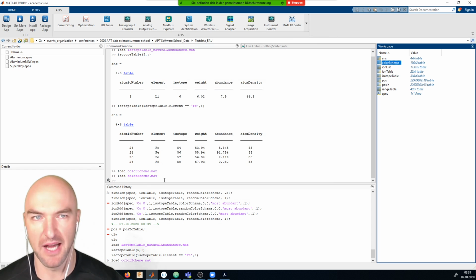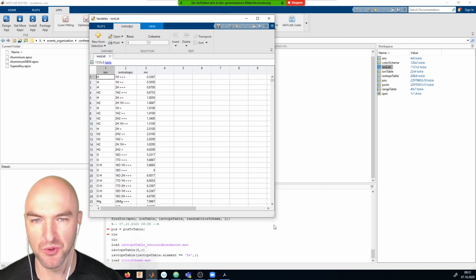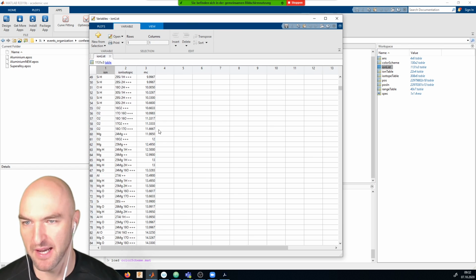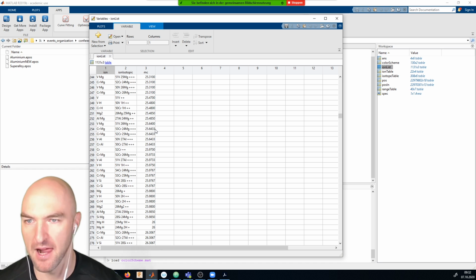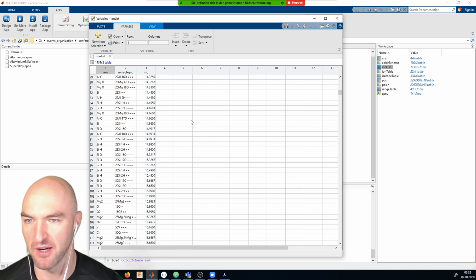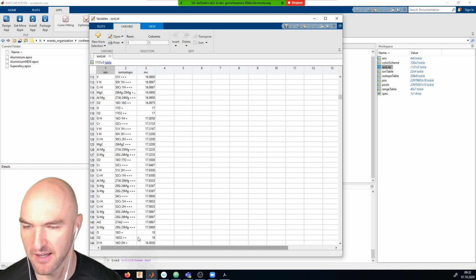Okay, which brings us to the last ground truth, which is the ion list. And so the ion list is a list of potential ions in your data set. So you can see here, this is one that my student Martina has actually made for her aluminium data set. And you can see that it's all ordered by mass to charge, and then what ion it is and what ion it is in an isotopic way. So you just saw the writing that I showed you before.